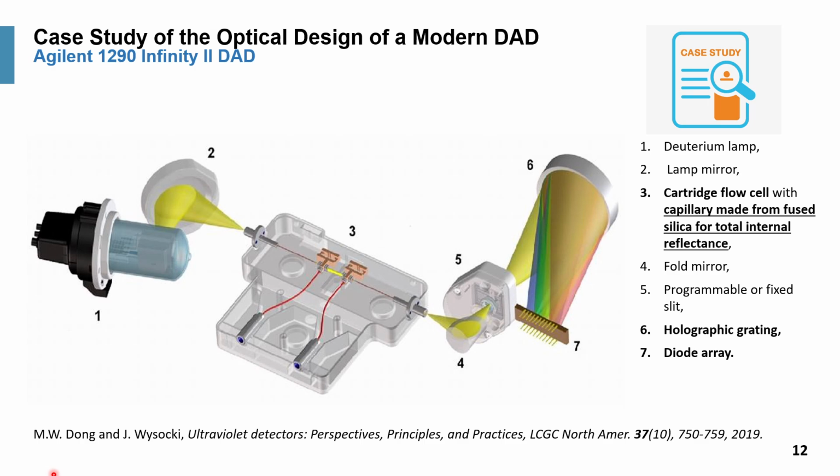Most of the material shown in this video came from this white paper published in 2019. It's called Ultraviolet Detector Principle, Perspective, and Practices, in LCGC magazine.